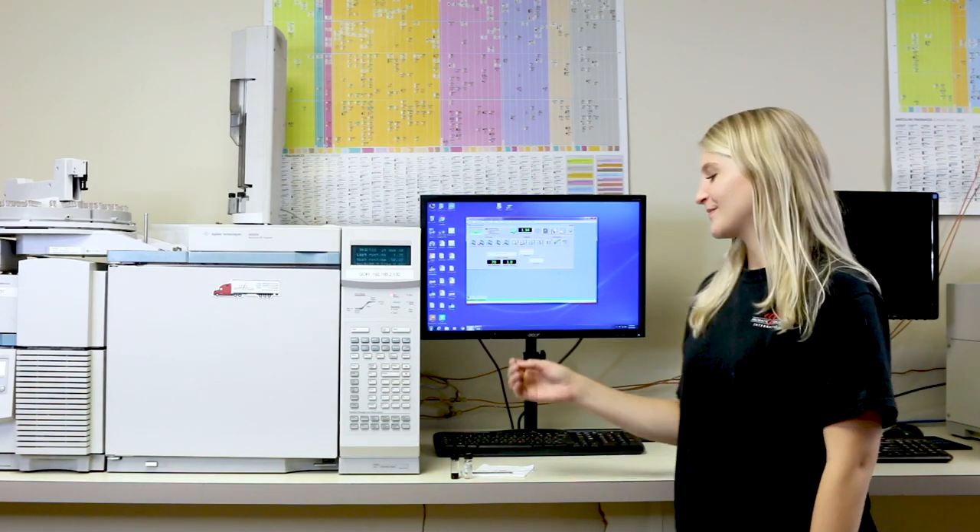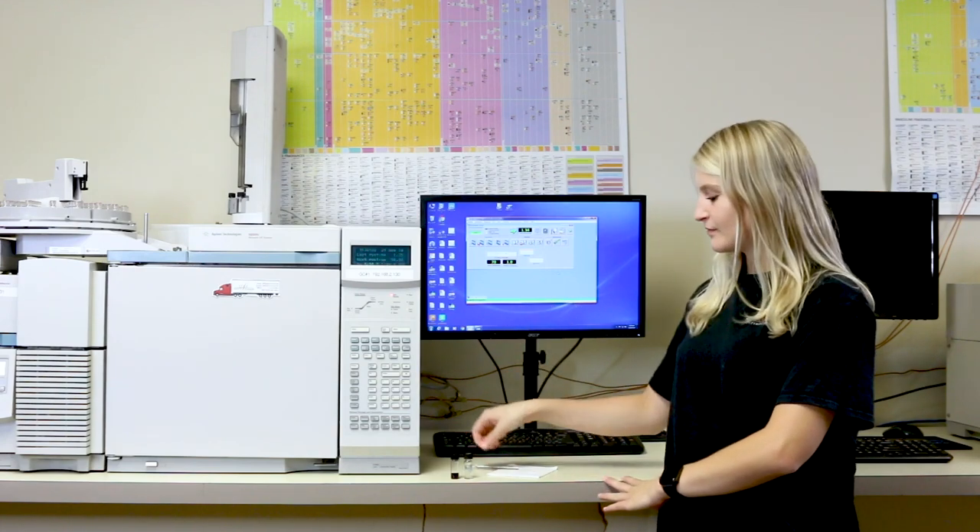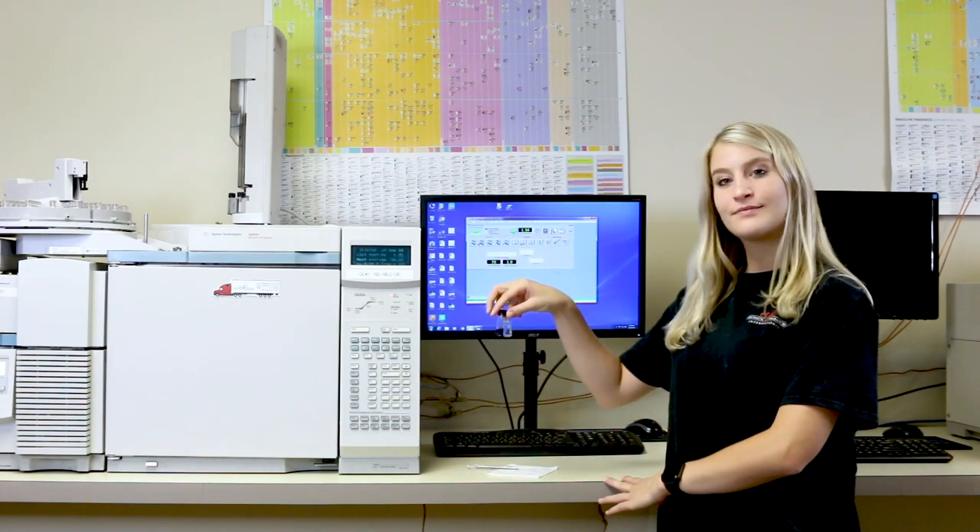Hey, it's Jada! For the extraction, we'll be using a syringe, the fragrance oil you extracted, and alcohol for cleaning purposes.